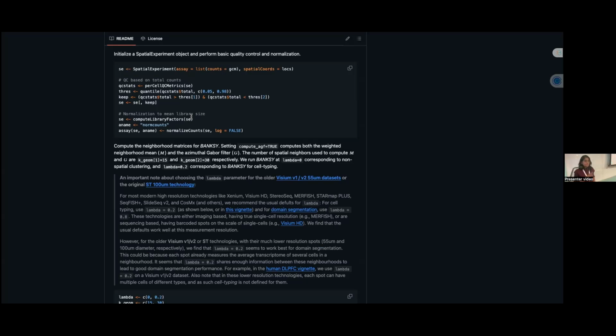So they cannot fine tune the first part, all right, but just know that they are taking in the processed data from the first part, your normalization, your transformation. So all that matters, how much you filter and how much you don't filter actually matters, all right? And they make it clear here.